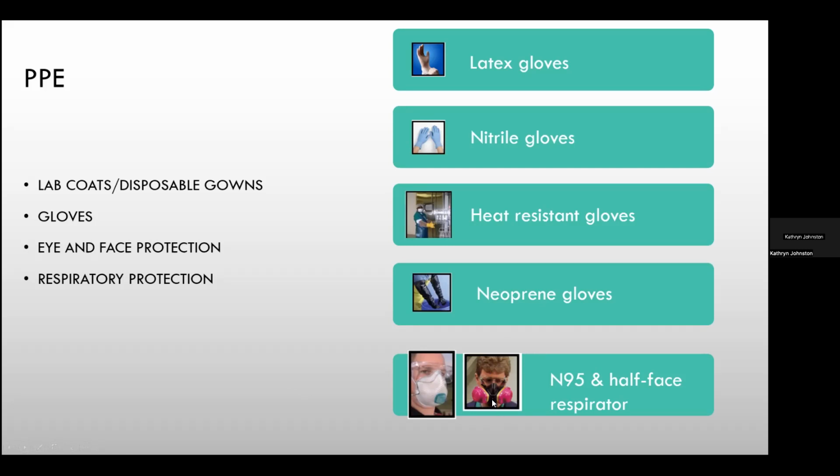It has the same efficiency, the 95 to 99% that you can see in the N95 and the N99 respirator masks, disposables, but it has the added value of being able to put filters on that benefit when you're dealing with chemicals. So if you have somebody who's working around formalin, then they should be wearing this type of mask to help protect themselves.